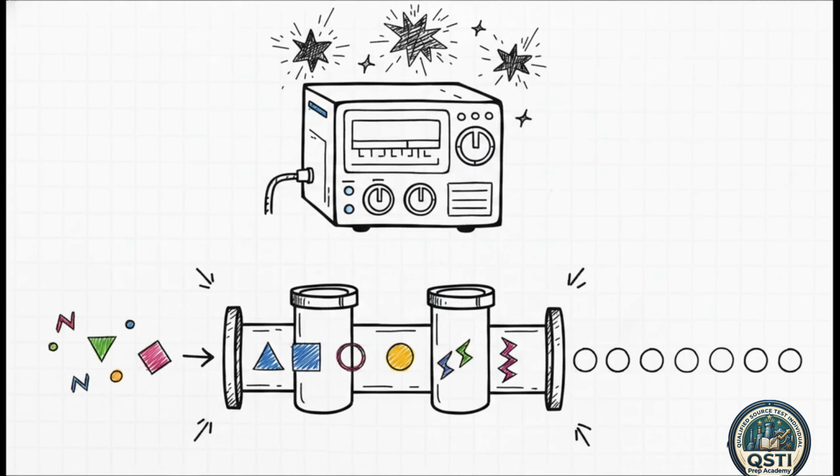Definitely not good. To fix this, Method 10 gives field testers two main options. Option 1 is digital, instrumental correction. This is where the analyzer itself is smart enough to digitally compensate for the interference of those other gases. Option 2 is physical, utilizing traps. Testers can use silica gel and ascarite traps to scrub the sample gas. The silica gel handles the moisture, while the ascarite chemically reacts with and physically yanks the interfering carbon dioxide right out of the gas stream before it even reaches the analyzer.